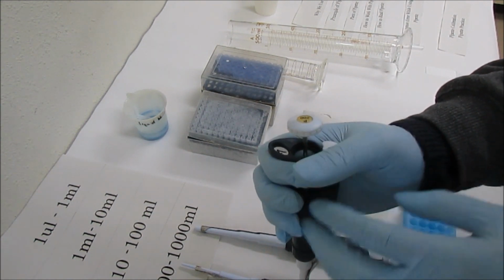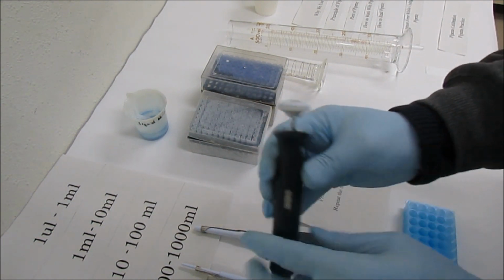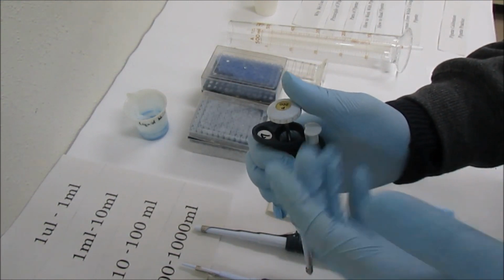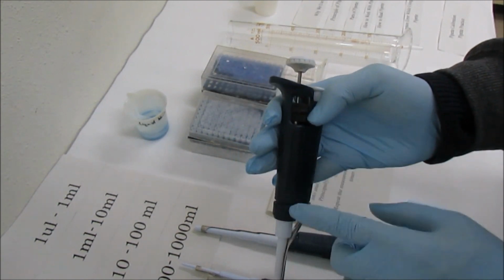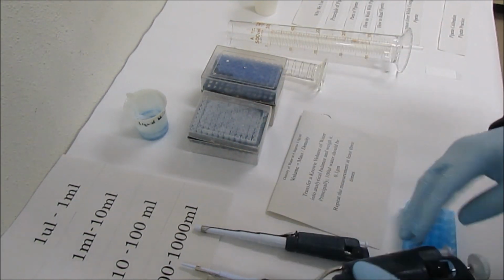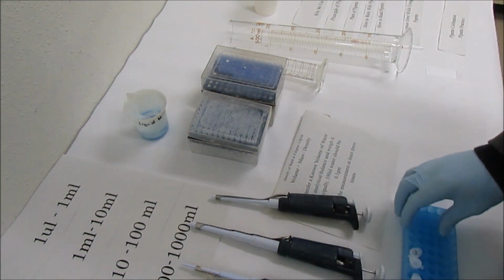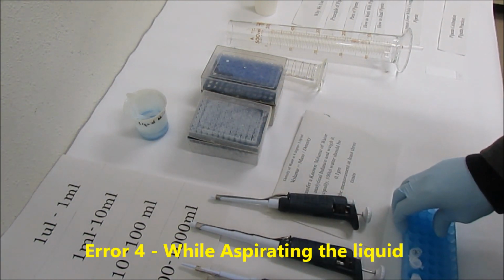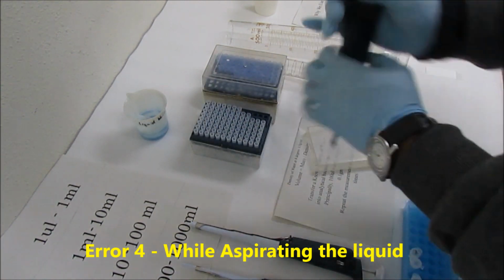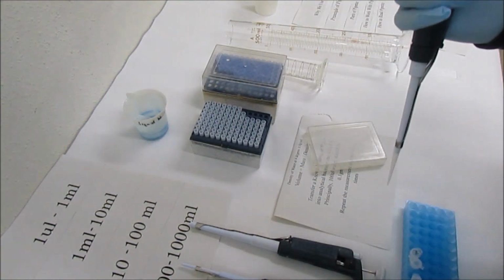This is bad. I'm sorry, just for explanation. Because if you release it suddenly, it might break the internal settings, right? So that could be a problem. And fourth, aspirate the liquid properly. This is very important. I will tell you what you do not need to do.